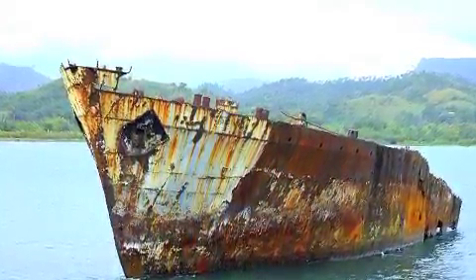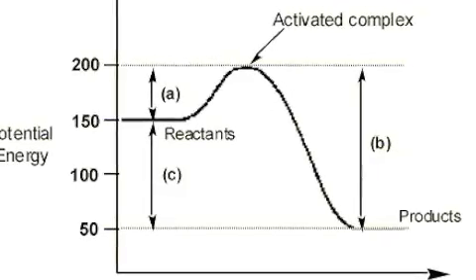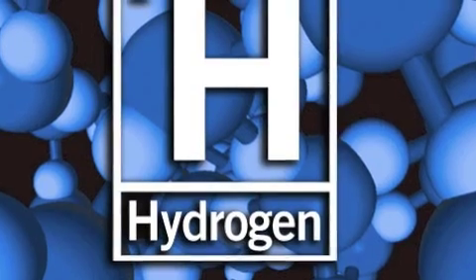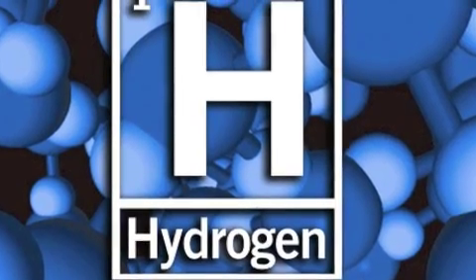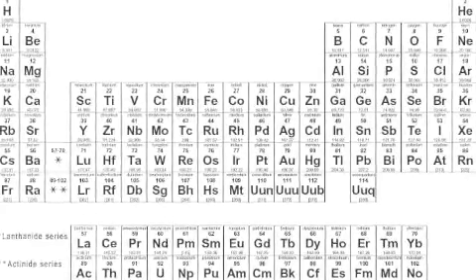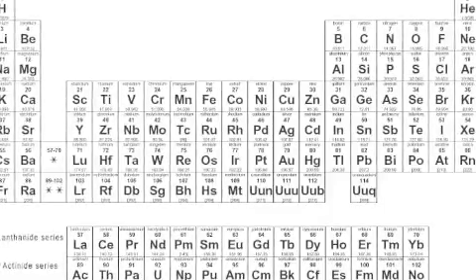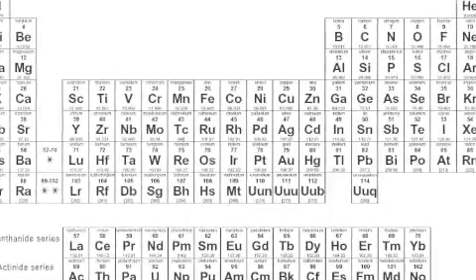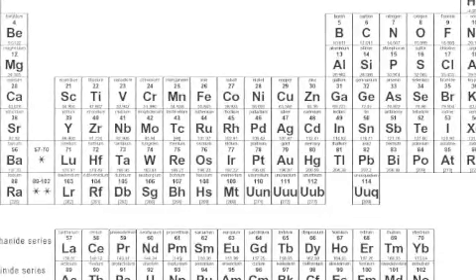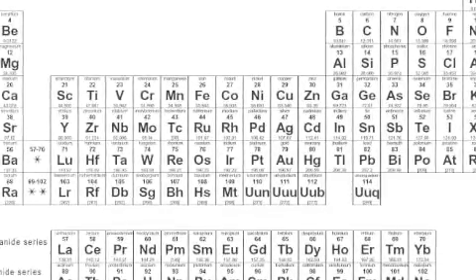The reaction that takes place is an exothermic reaction, and in this case, a single replacement reaction. This replacement is between a metal and hydrogen in the H2SO4. The choice of metals is a very important one. The reason we chose the metals we did, which was zinc, iron, and calcium, was that not only were all of these reactive metals, they were also in the same period. This makes it so patterns can be seen within the sublevels and can be related to atomic trends.